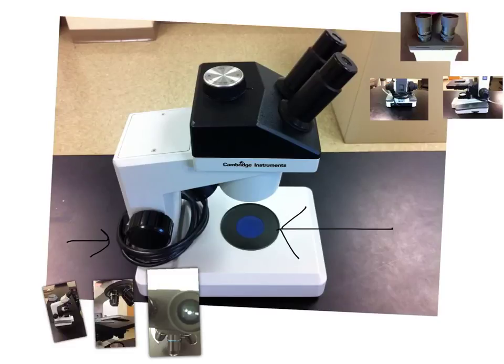And this is for seeing objects that are larger than you could normally see with the naked eye. So you can look at your entire hand, mostly objects that you would want to dissect.